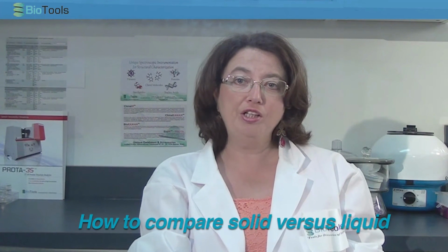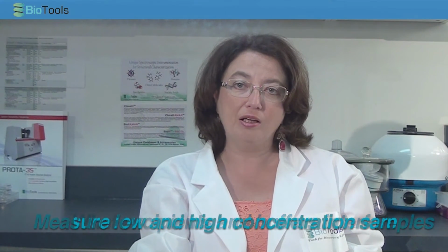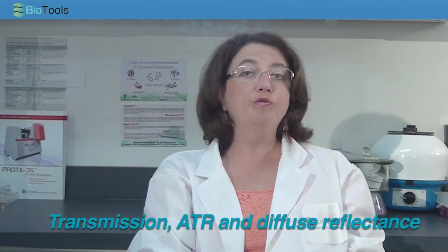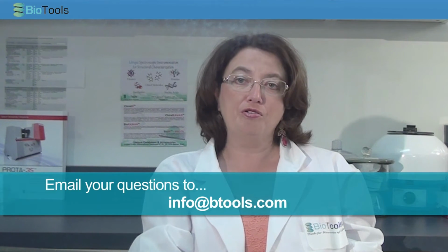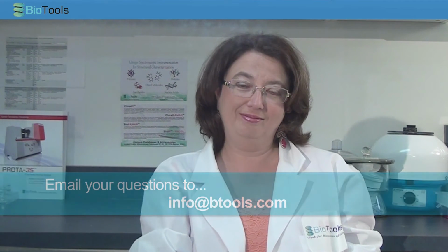Some other sources are either unclear or inaccurate in providing guidance. So in the upcoming segments, we will address a variety of questions that present some of the challenges, such as how to compare liquid versus solid formulations, what excipients and buffers interfere in your spectra, and how best to subtract them. What is the best way to measure low and high concentration samples? What is the difference in measurements in transmission, ATR, and diffuse reflectance? And finally, how does one compare structure? I welcome your questions and thank you in advance for joining me.